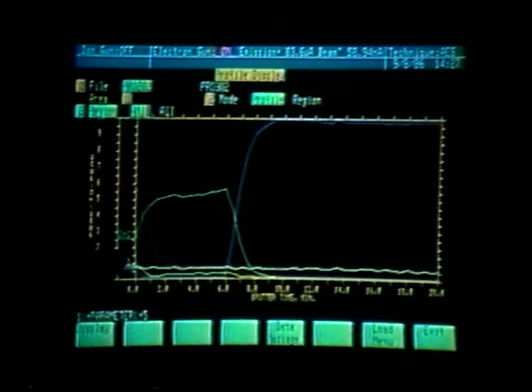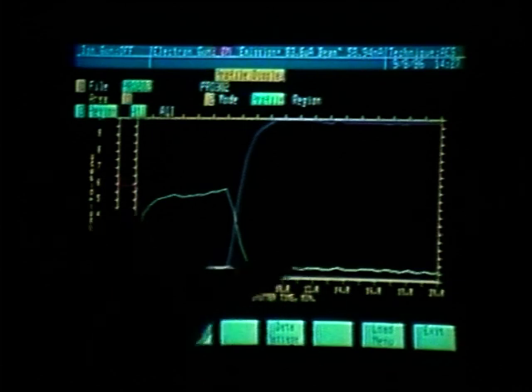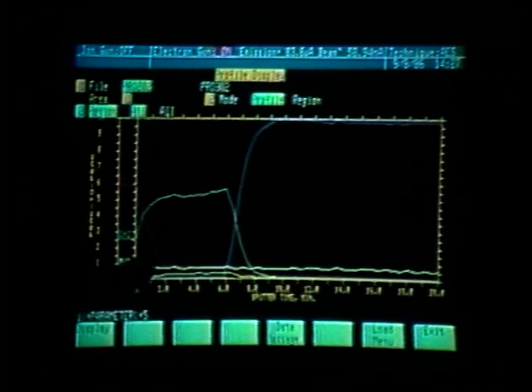We then looked at the silicon peak, which looks like we have as much silicon present as we do carbon through all of the layer. Evaluating the peak-to-peak height of silicon at 4 minutes, we find that indeed there is no silicon present. It is only noise level that is being displayed.